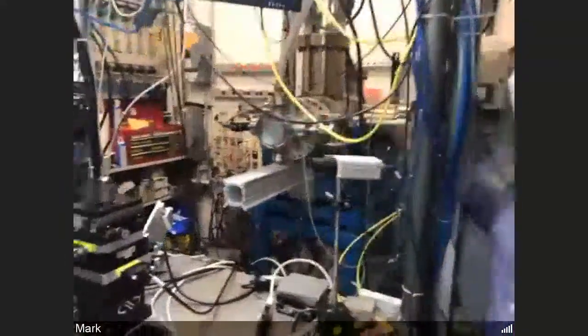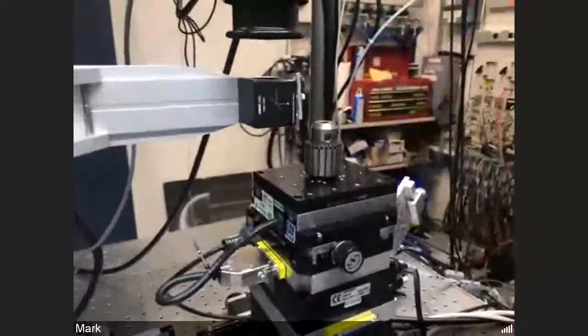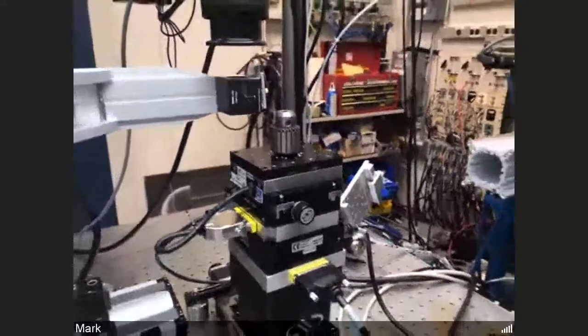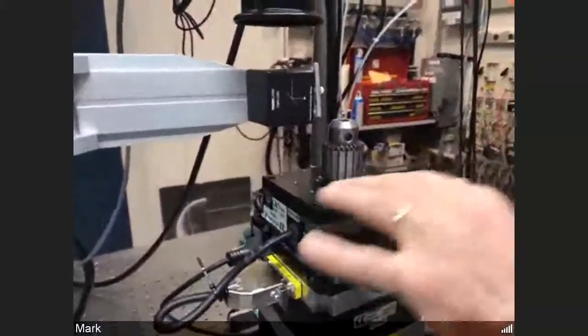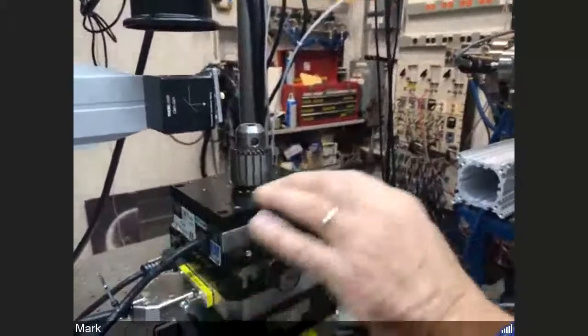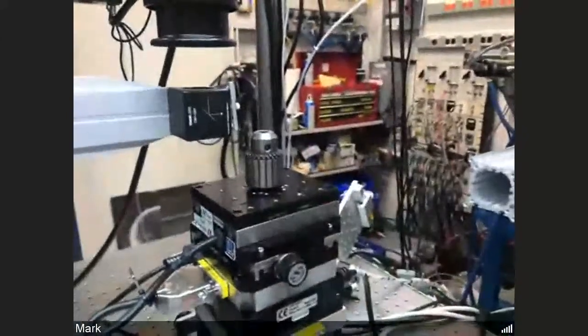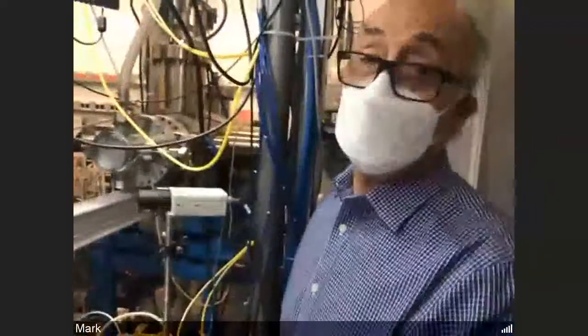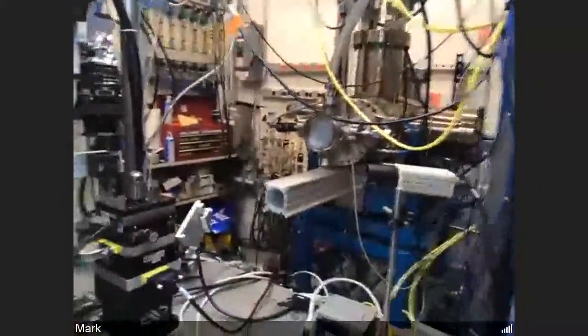This is the five-axis optical table that I was talking about. It's currently in its lowest position. The X-ray beam comes out this aluminum window, goes through the air here for half a meter or so, and then this is where the sample's mounted. We often use drill chucks to mount the sample because they're convenient, but they screw into this base plate here, and if you have your own apparatus, we can accommodate that as long as it's built so that we have a way to adapt it to this mounting plate. Like yesterday, I had an in-situ testing apparatus, a uniaxial force apparatus, mounted on here doing some experiments.